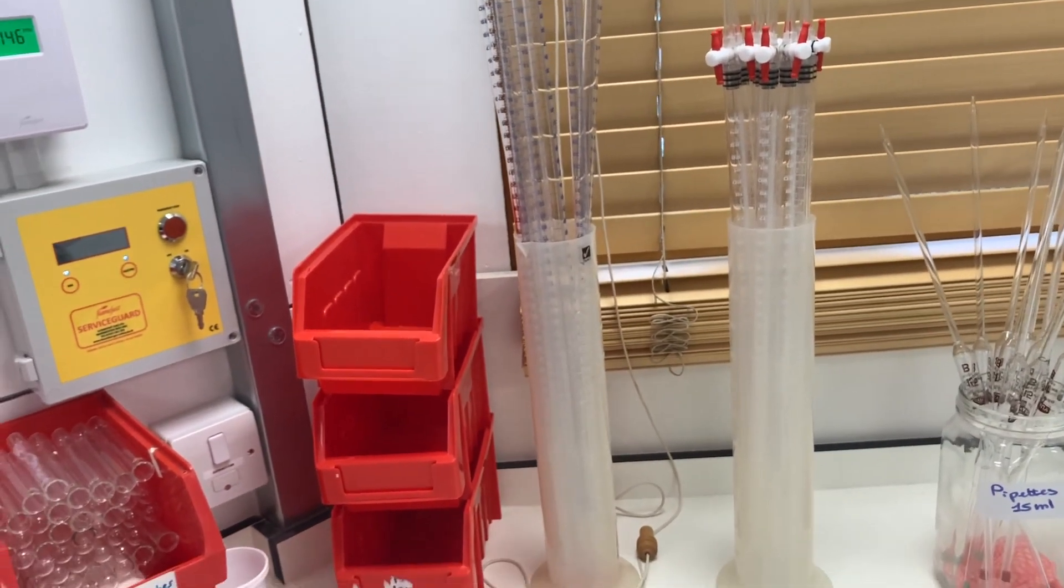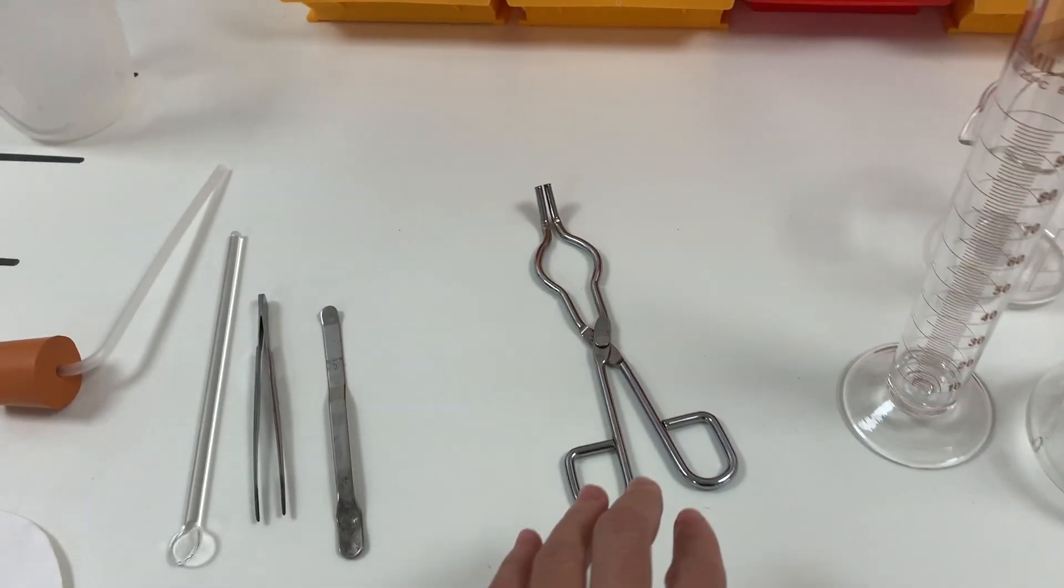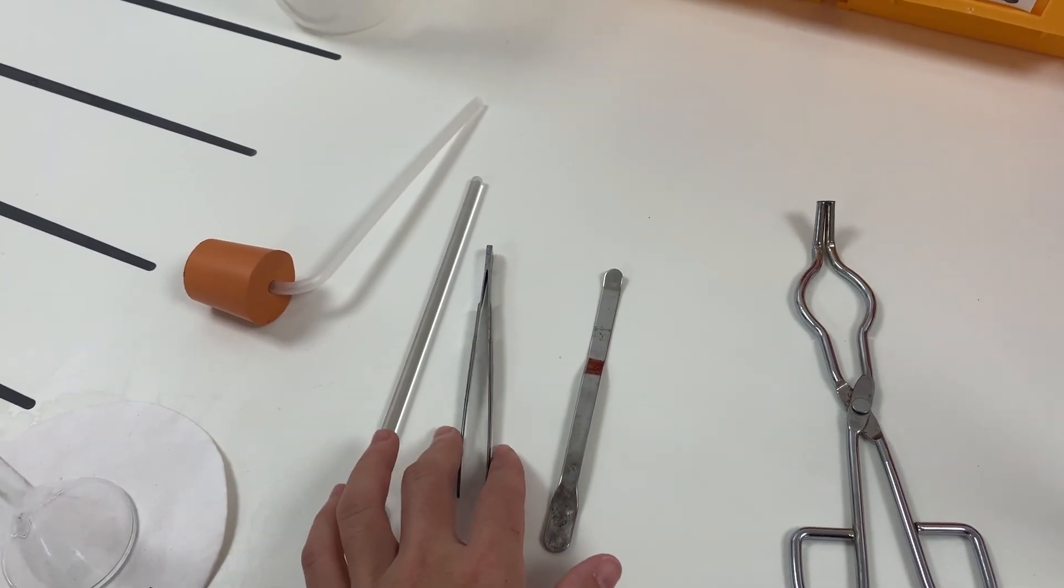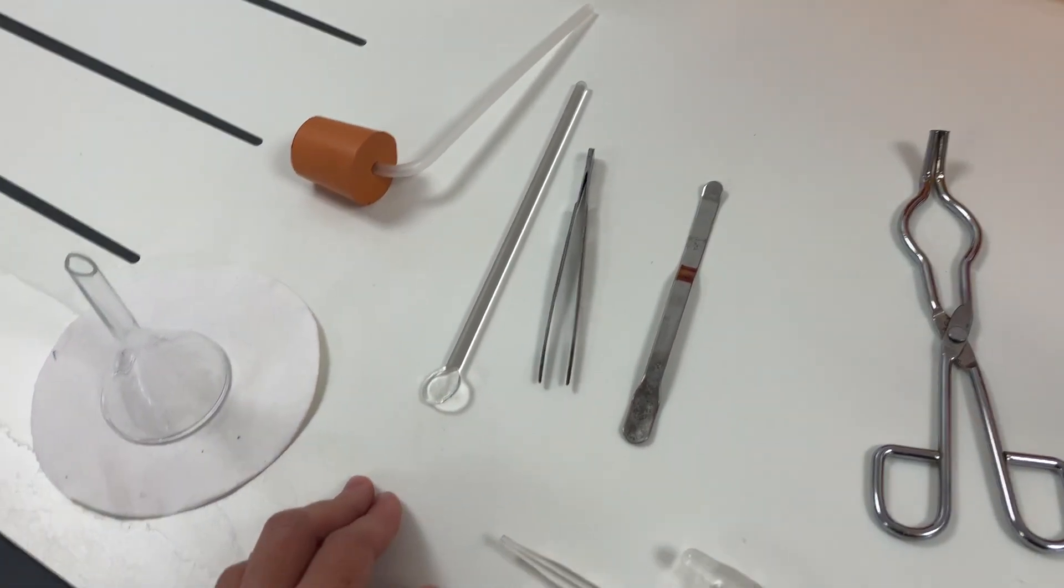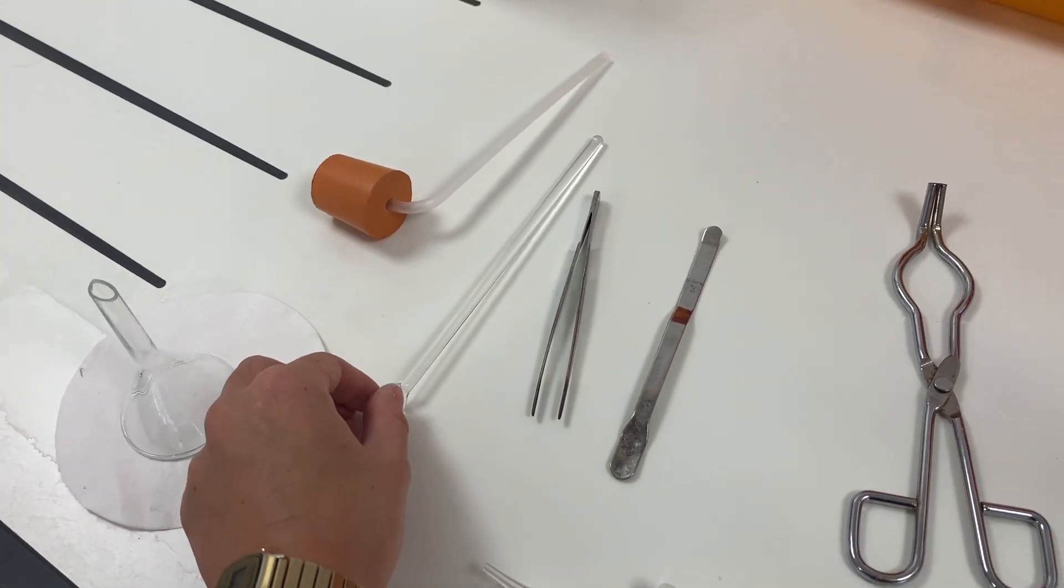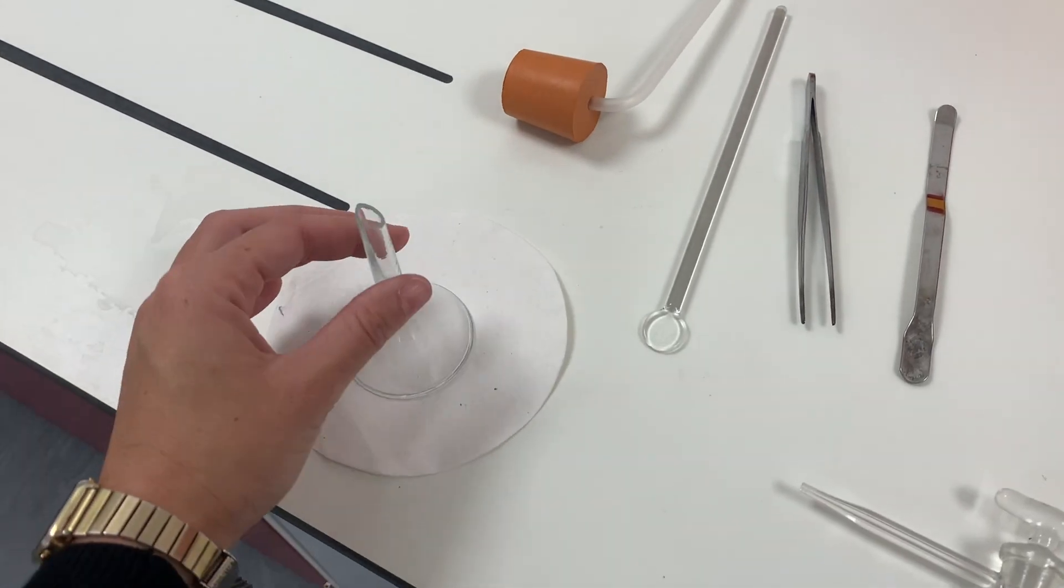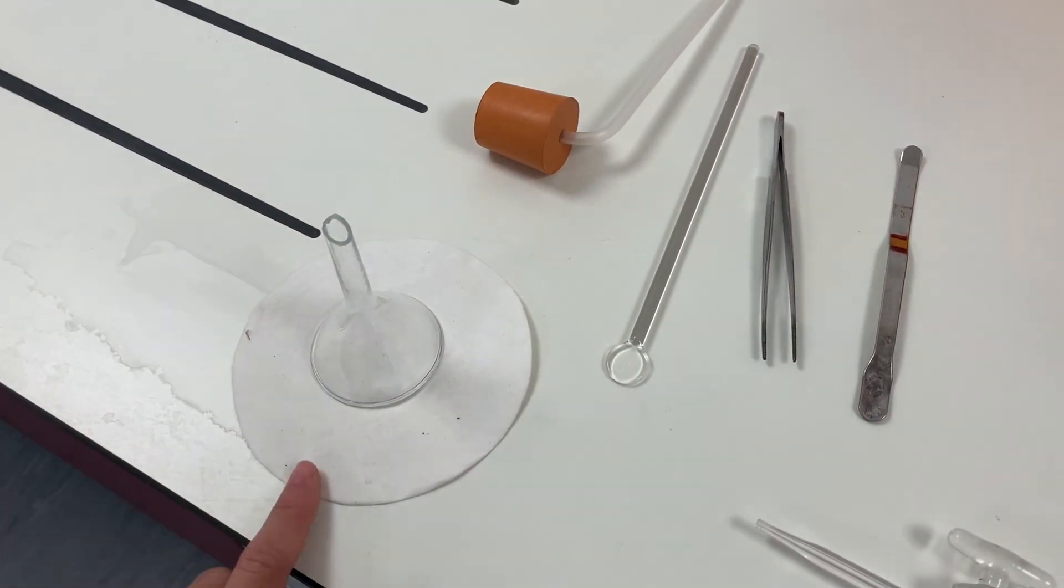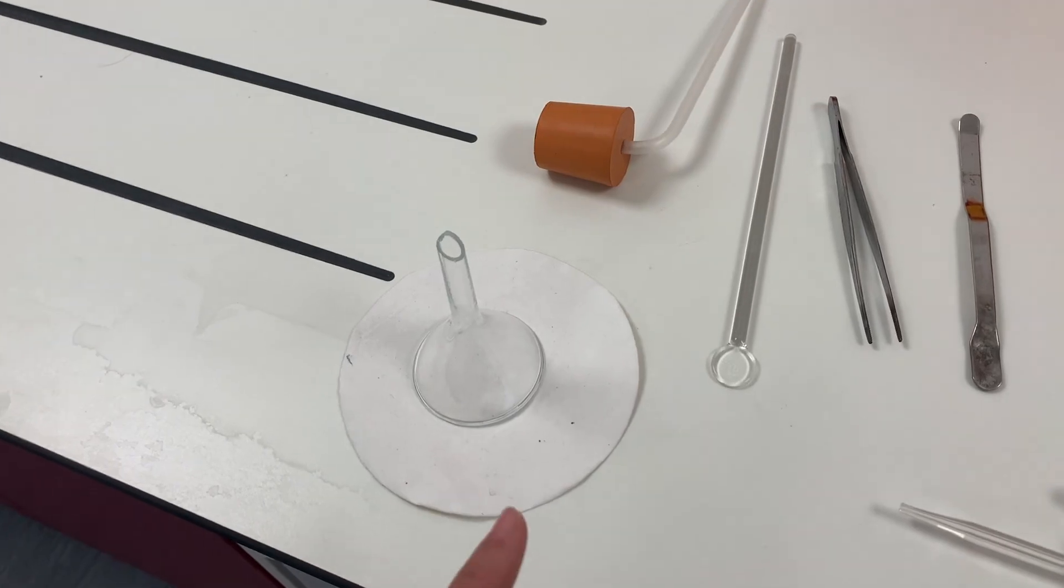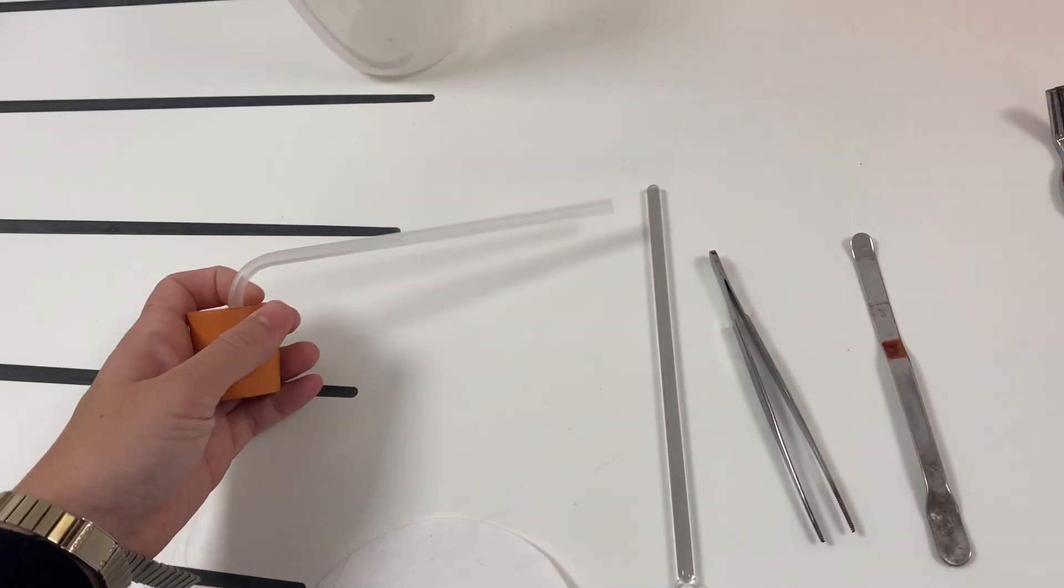We've got some tongs here, a spatula, forceps, and a glass rod that's used for stirring together solutes and solvents. This is a funnel in which you place the filter paper in order to filter solutions, and then we have a bung here together with a delivery tube.